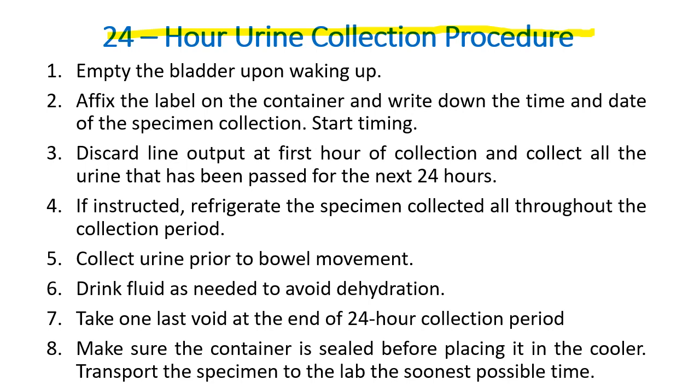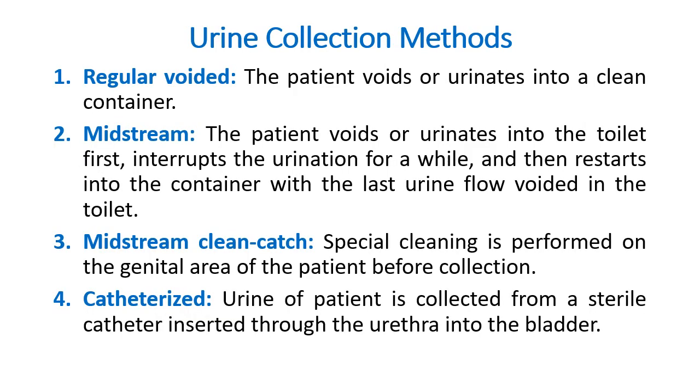Tapos, take one last void at the end of the 24-hour collection period. So, make sure that the container is sealed before placing it in the cooler. Transport the specimen to the lab as soon as possible. So, ulit lang to, urine collection methods.